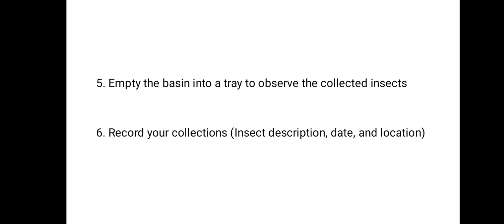What you do is to observe the trap to make sure that the targeted insects have been collected into the trap. Once you are sure of that, the next is to do point number 6.